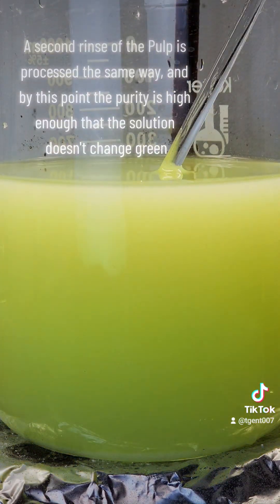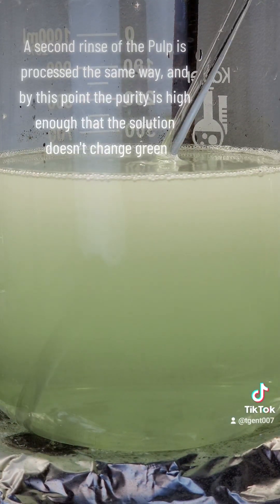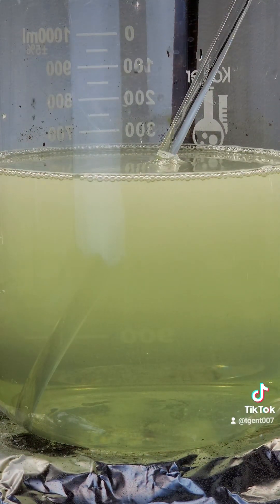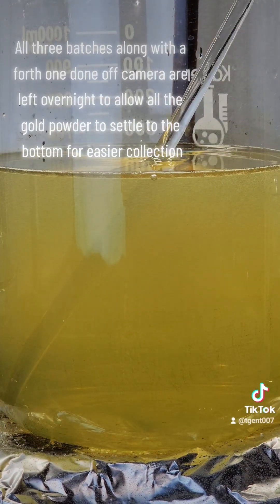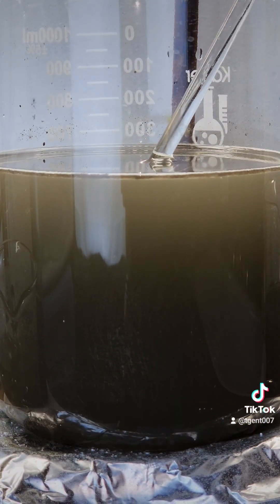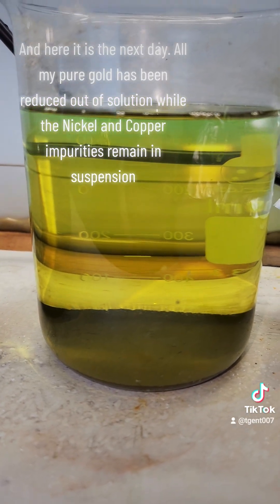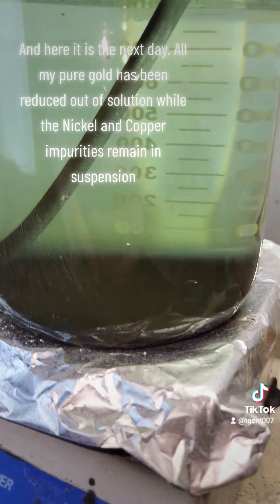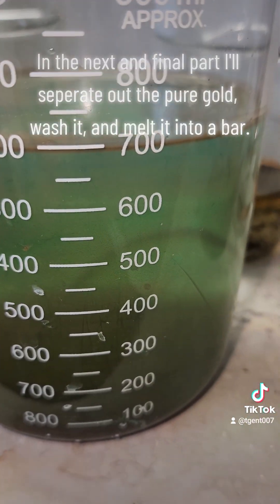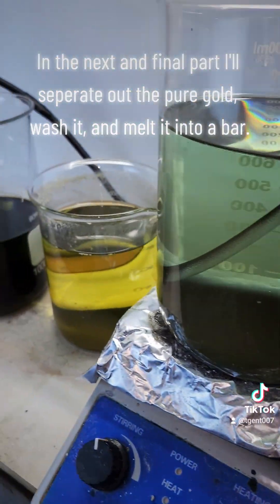A second rinse of the pulp is processed the same way. All three batches along with a fourth one done off camera are left overnight to allow all the gold powder to settle to the bottom for easier collection. Here it is the next day — all my pure gold has been reduced out of solution while the nickel and copper impurities remain in suspension. In the next and final part, I'll separate out the pure gold, wash it, and melt it into a bar.